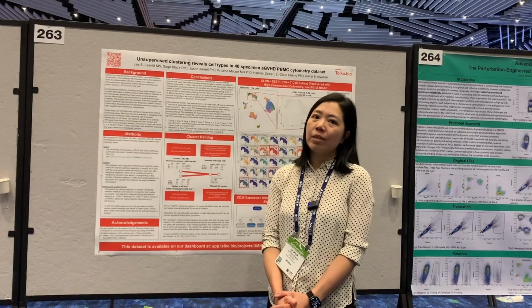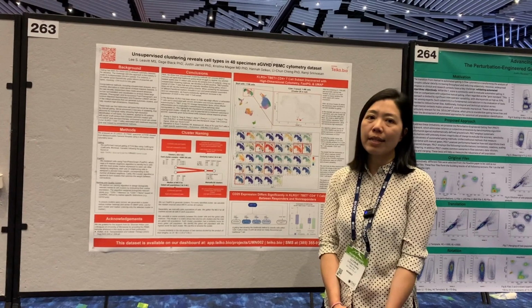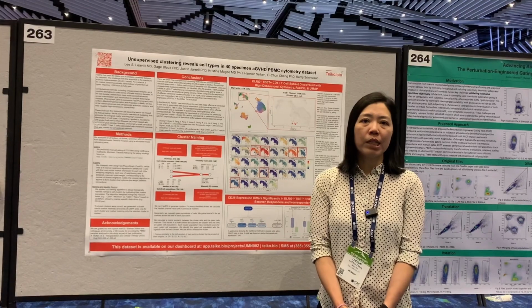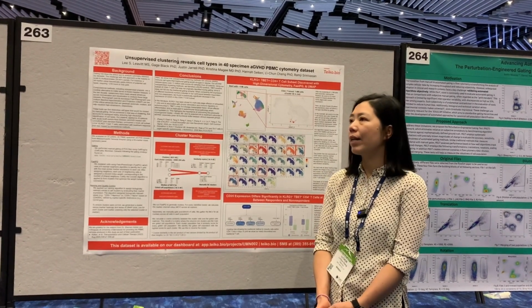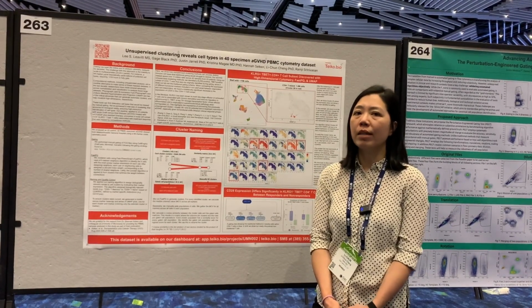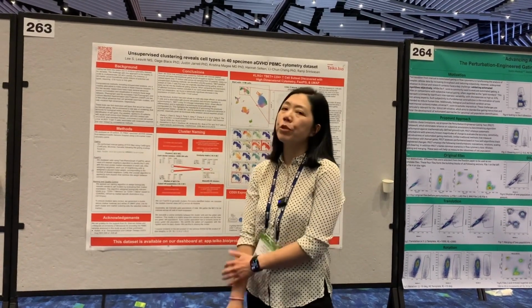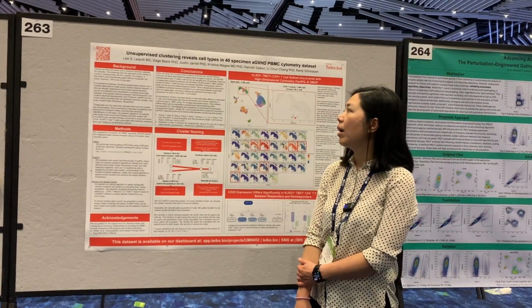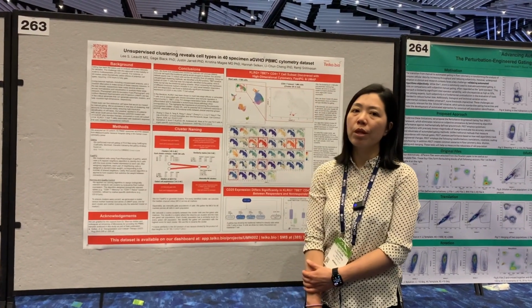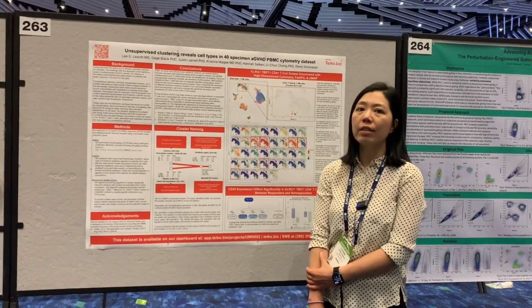Just to give everybody a little background, gating has been the major tool to analyze cytometry data, but gating can get really labor intensive when your cytometry panel has a higher and higher number of markers. For example, gating a cytometry dataset with a 44-marker panel would, in theory, yield almost billions of potential combinations, and that requires hundreds of hours to fully gate the dataset.